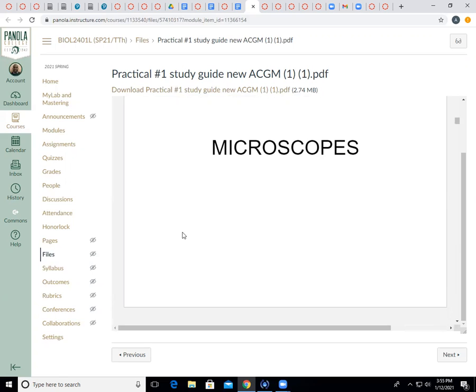First off, what chemical is being described on this material safety data sheet? Hydrochloric acid. So your facility may have hydrochloric acid somewhere in the facility. With having that container of it, they should also have a data sheet, a material safety data sheet.